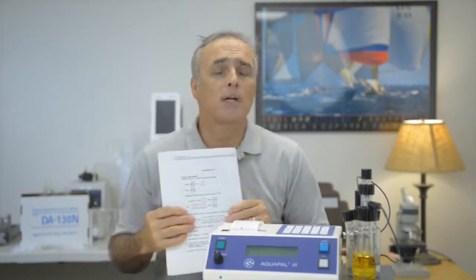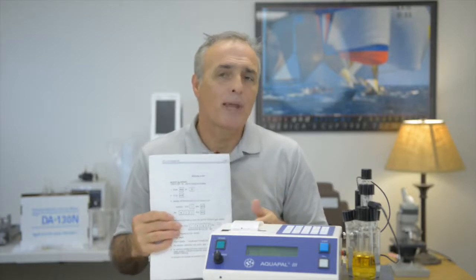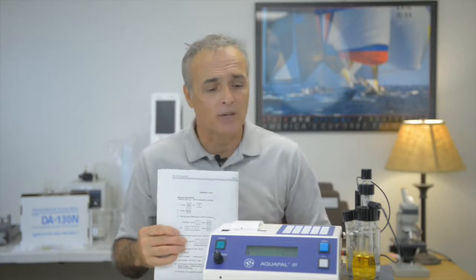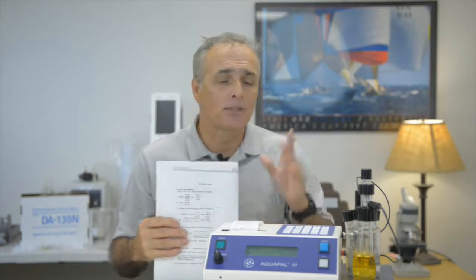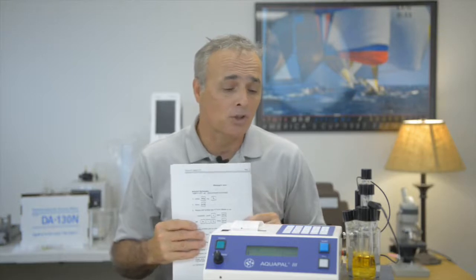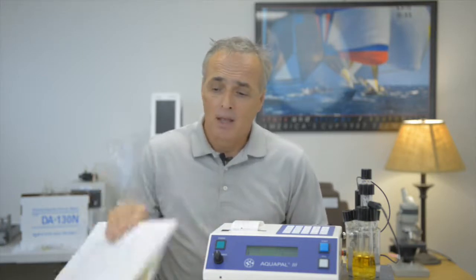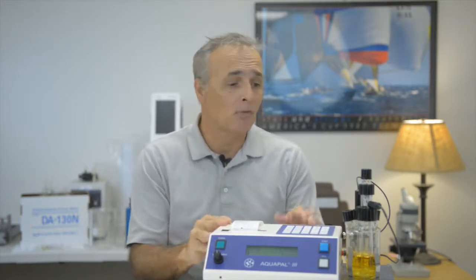I think one of the big questions that people have is, do we have to enter every time we run a test? Do we have to enter ppm or percent? And do we have to tell it its specific gravity? And do we have to put in the volume and so forth? What I'm going to show you today is a pro tip. You don't have to enter the data every time, and simply once you input that data into the Aquapal, you can then just come up and run a test every time just by pressing the start button. So let's go ahead and do that.